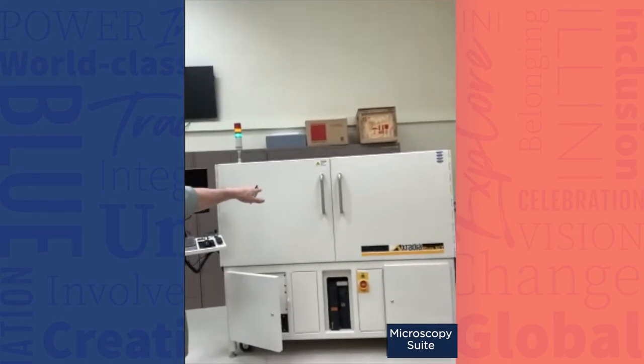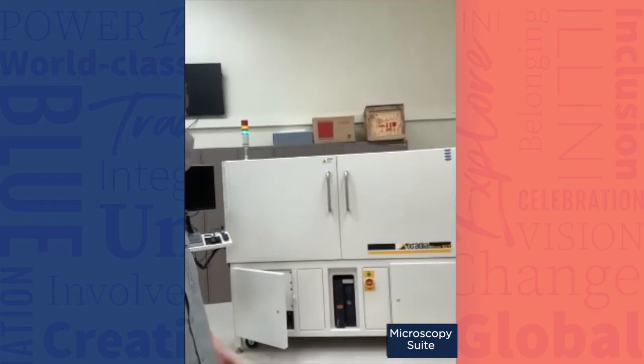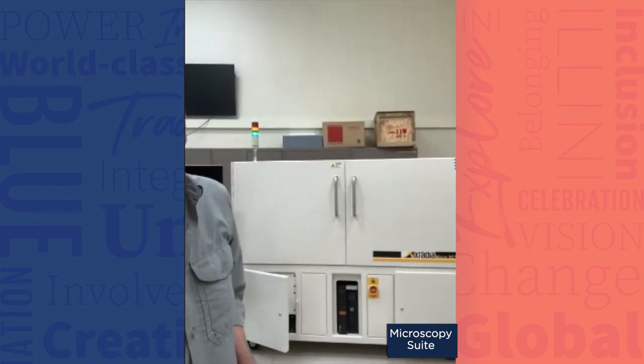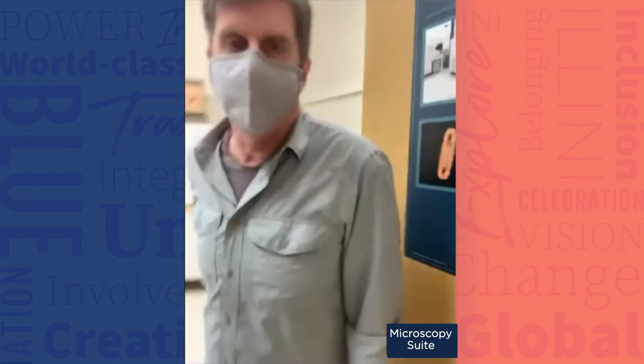We have an X-Radia micro-CT system — you can look at insects, you can look at bone. This is also another X-Radia system and we've set it up in various ways, making different modifications so that you can look at things in liquids. We have people who work with plants, and if you cut a leaf open it's going to bleed out, so it's set up so that we put a piece of leaf inside a straw, seal it up, and do that kind of work. This is really a pretty nice micro-CT setup.